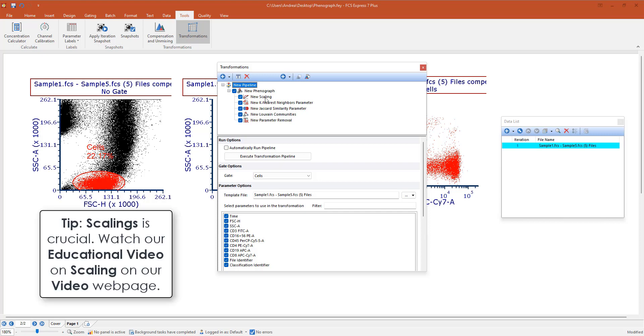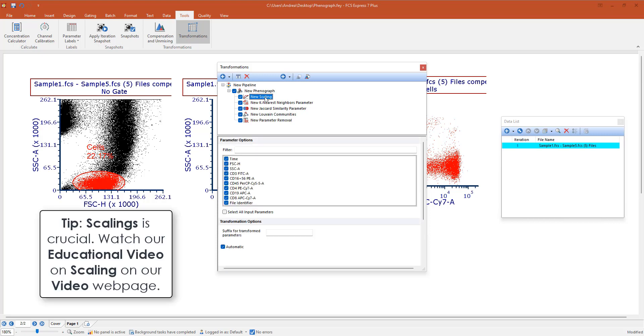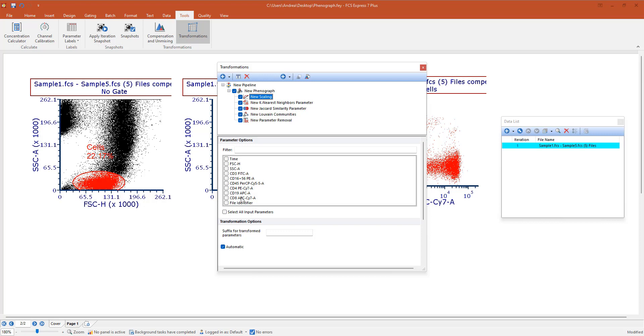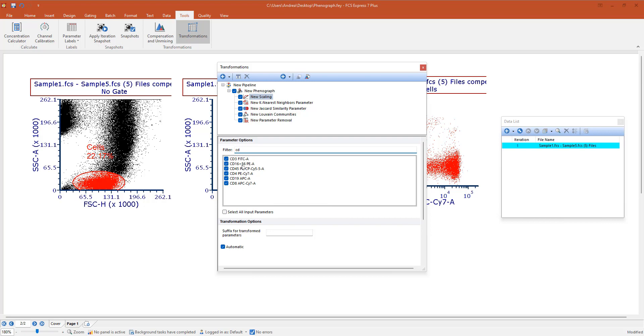First step in the Phenograph is the scaling. So we are going to select the parameters of interest that will be scaled and then used for running Phenograph. I want to show you the right click option here, so I can deselect all. And if I want to select all fluorescence or all the CD markers, for example, I want to show you the filter. So in this case I can type CD and then I can select all. And if I want to exclude a few, feel free to do that.